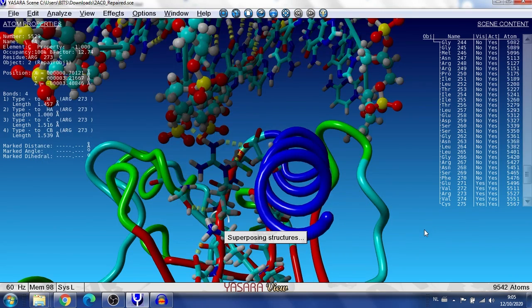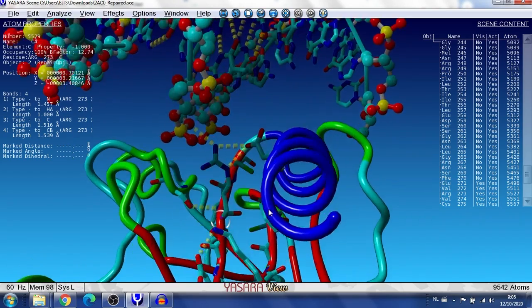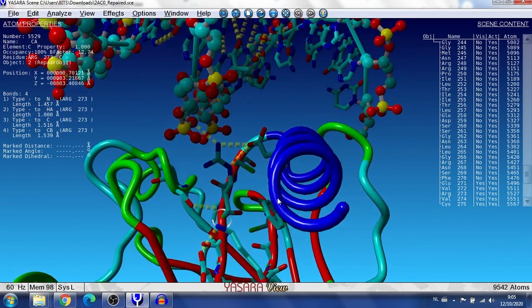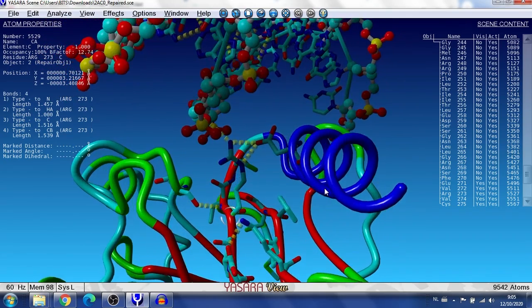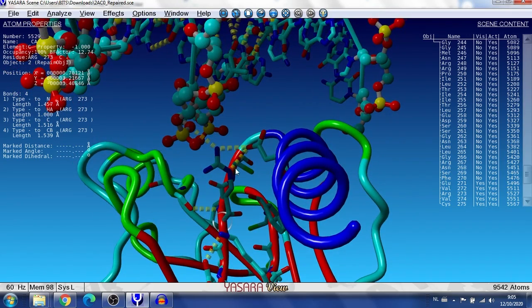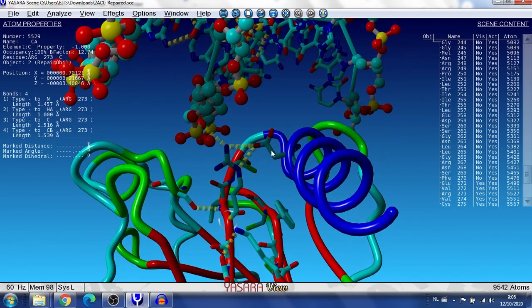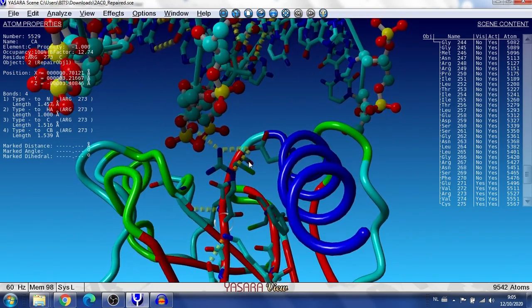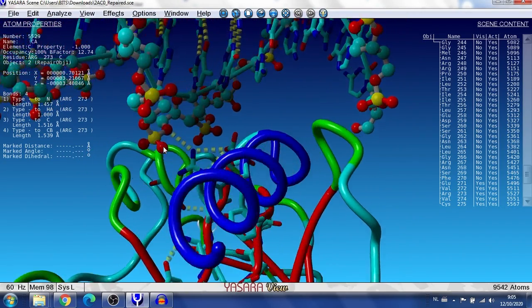So you see this goes very fast. And in our first view, of course, you see here again the arginine with the hydrogen bonds to this side chain of the same protein, P53, but also, of course, to this phosphate group here.